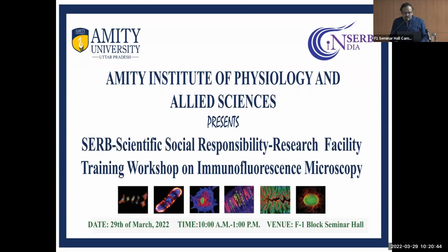But now, as we are gathering together, the COVID pandemic has gone down a little bit. So we have tried to do a workshop like this, which is in hybrid mode. So some are offline, and many people are online on the Zoom platform. So we have selected the immunofluorescence microscopy technique to be displayed here.